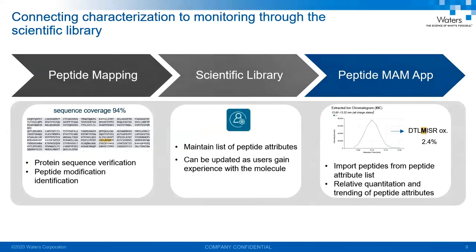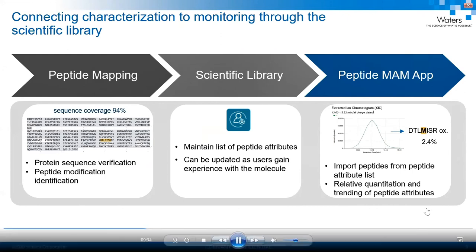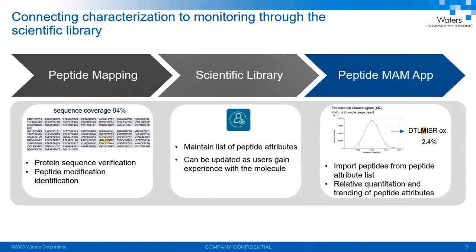Once data acquisition is finished using the BioAccord system, the next step is data processing using the peptide MAM application, starting with a list of product quality attributes imported from the scientific library. Scientific library is a feature within the Waters Connect platform. During peptide mapping analysis, we identify modifications of peptides and our peptide quality attributes, then store that information in the scientific library. In a way, the scientific library acts as a bridge between peptide mapping analysis and peptide MAM data processing.